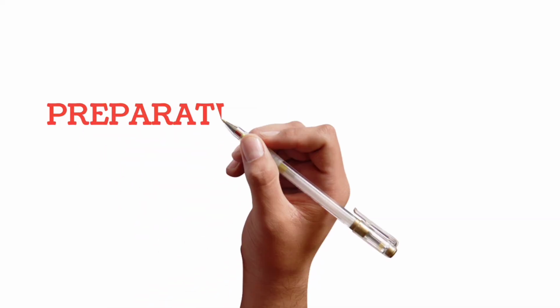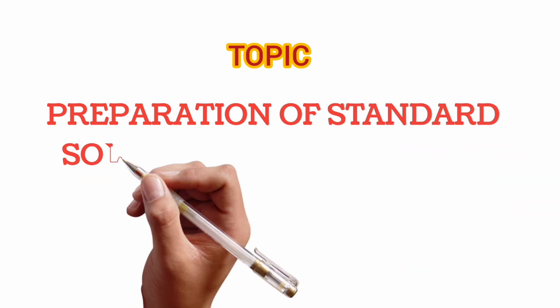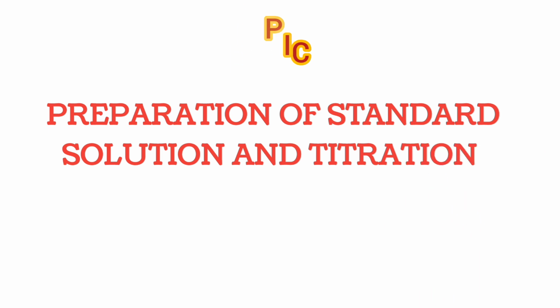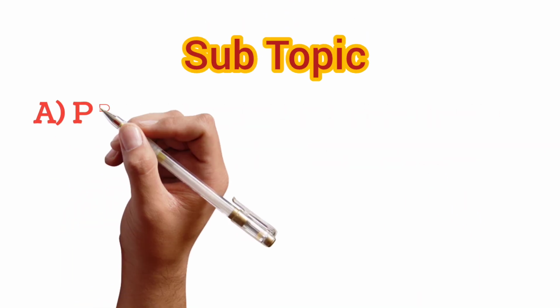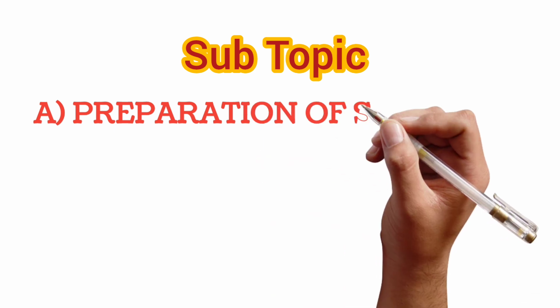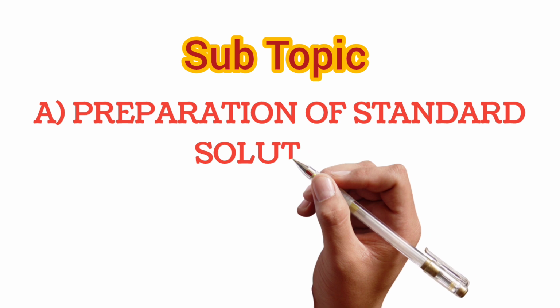Like I said, our topic is preparation of standard solutions and titration. And as our subtopic for today, we are going to be taking preparation of standard solution. That will be today's lesson.